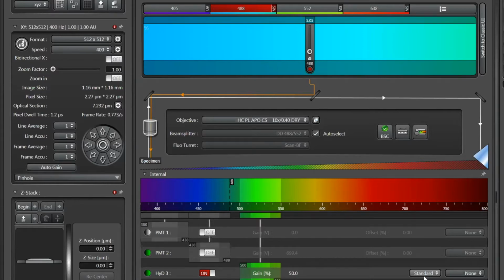If you are in counting mode where intensity units equal photon counts, then it's not automatically going to change. It applies the correction scaling factor to the image as you make those changes, unless you're in counting mode where a photon equals an intensity unit, and then it can't make any changes for you.